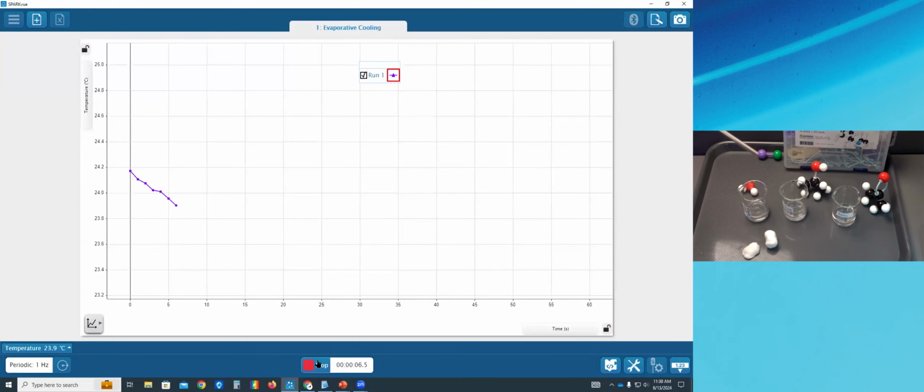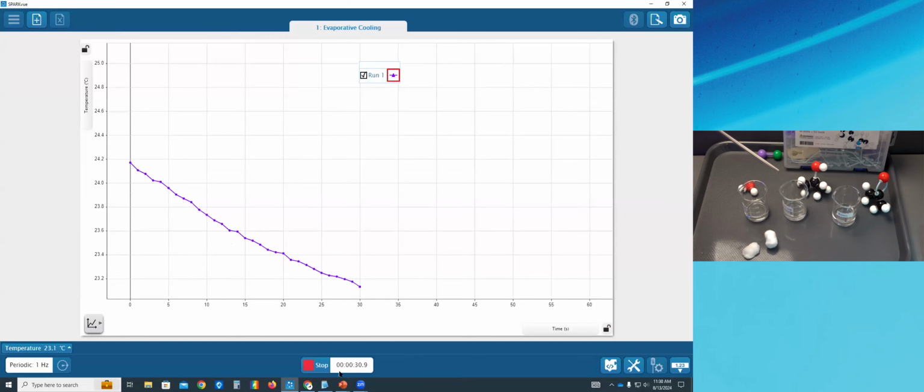And I'm trying to make it visible to you. Right now, I'm trying to show you the tip of the stainless steel probe. I can see the drop is hiding itself. There's a drop of water that's stuck right behind the bottom of that probe, you can't see it on the camera, but I can see it looking sideways. But I'm trying to not move because moving can affect the data. So students are directed, hold it still for 1 minute. And you can see that the counter's going here where I hit start. We're only 30 seconds in.